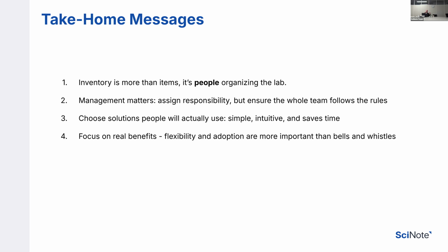Keep that in mind, it should not be one person, it should be multiple people. You need to include everybody, especially if they're going to be using SciNote and inventories. They need to understand why they are doing it and who they are helping with that.